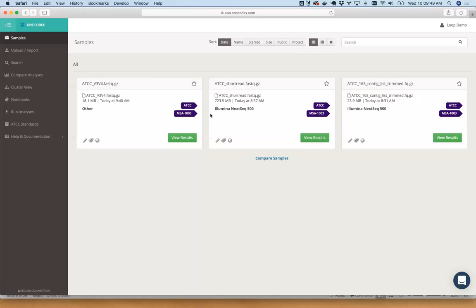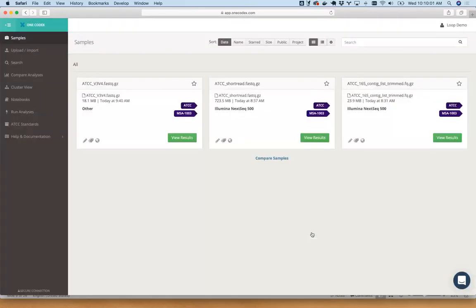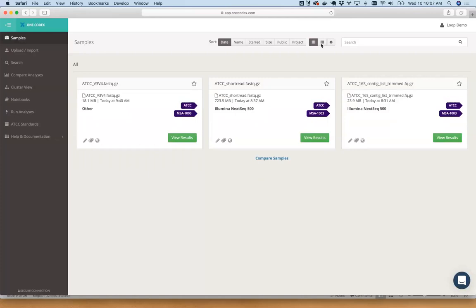One thing you may notice is there's all the basic functionality you'd expect in the system around metadata. We can see there's some structured metadata on these samples, and we can store a bunch of metadata alongside our samples. With tagging, we can filter. In this case, it's not very interesting because I only have 3 samples, but we can browse this data in a bunch of different ways.